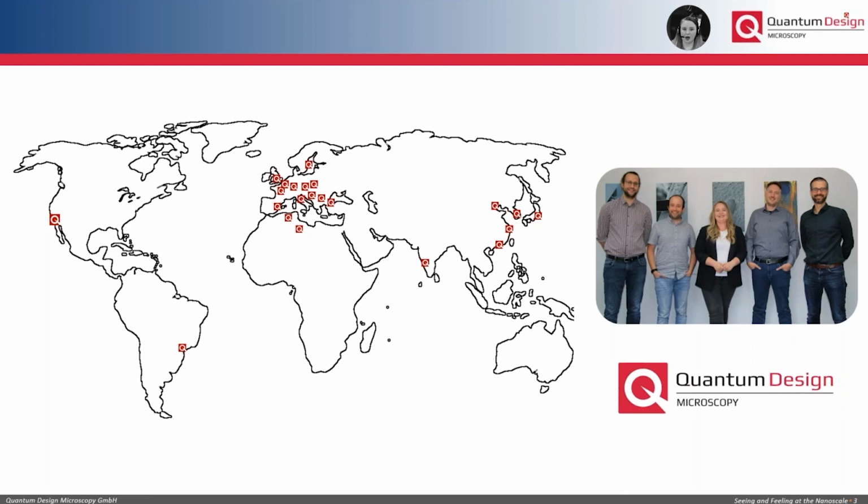To give you an idea which parts will be featured in today's webinar, we will start with a quick presentation, followed by a short question and answer session. After that, we will go into the lab and show you live how we measure with the FusionScope. And after that, we have another question and answer session. At all times during the webinar, you can put your questions in the chat, which you can find at the bottom of the control panel. And now, without further ado, I will hand over to my colleague.